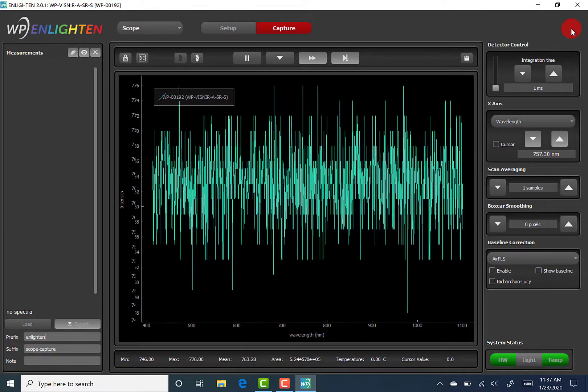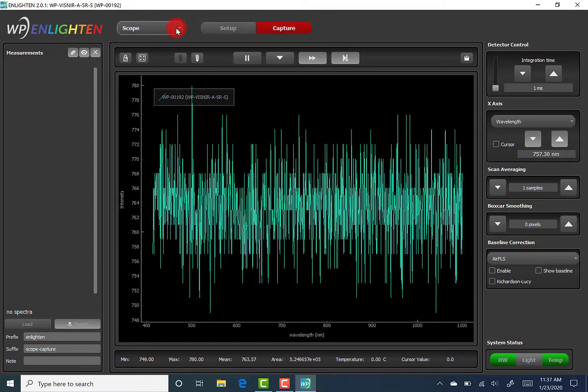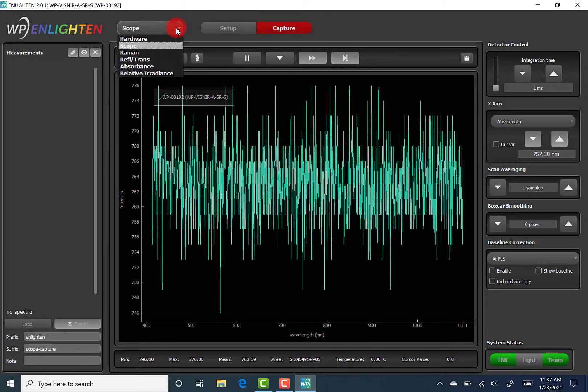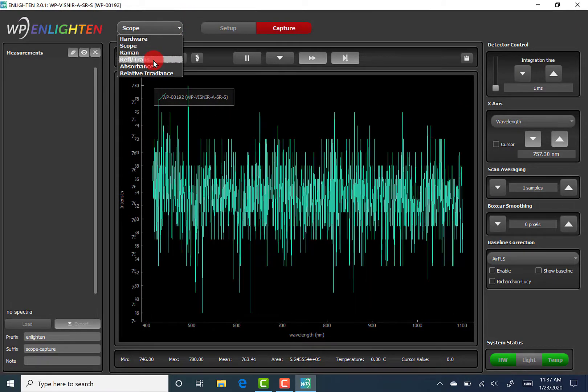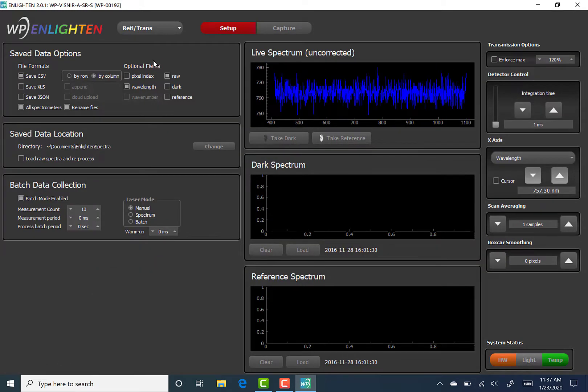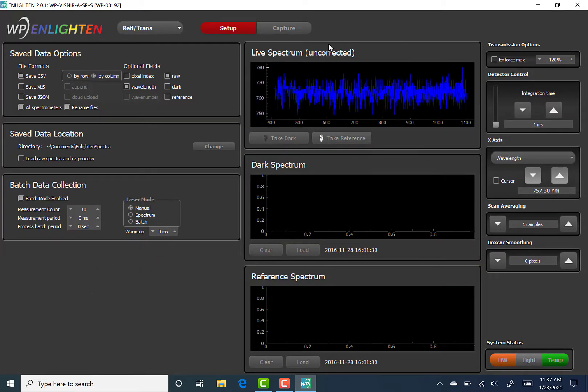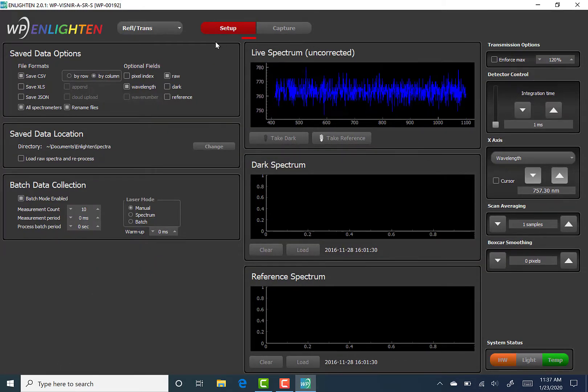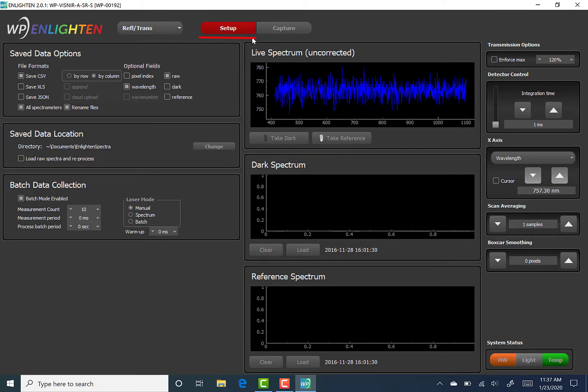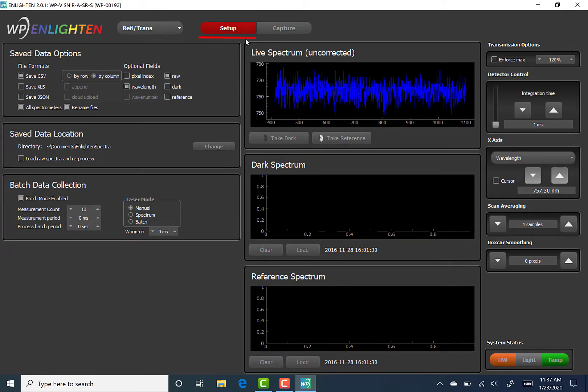Since we, by default, are in scope mode, let's switch to reflectance/transmission technique just to see what we're talking about. Right away, the software takes us to the Setup tab, where various configuration options are available to the user.